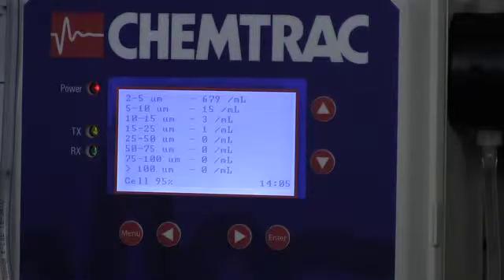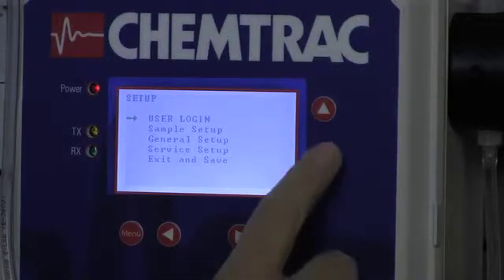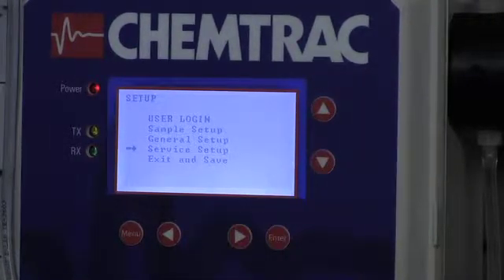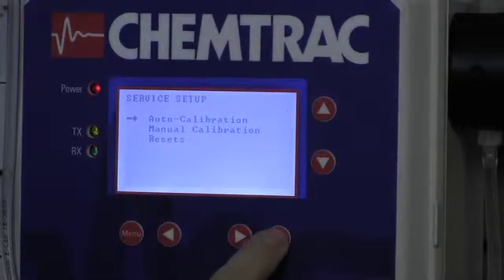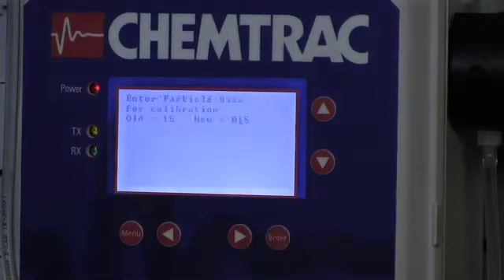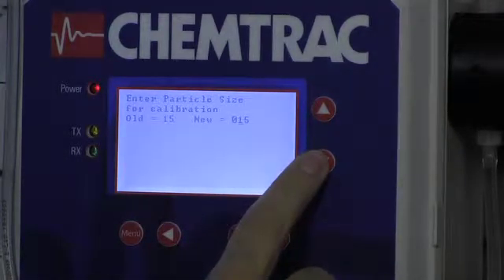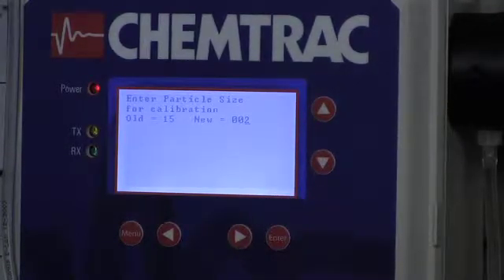So what we're going to do is go in and actually perform the calibration. This is where things get a lot easier. We're going to go to the menu, go to service setup, go to where it says auto calibration, auto adjust threshold, and then we're going to tell it we want to calibrate 2 micron, and enter.